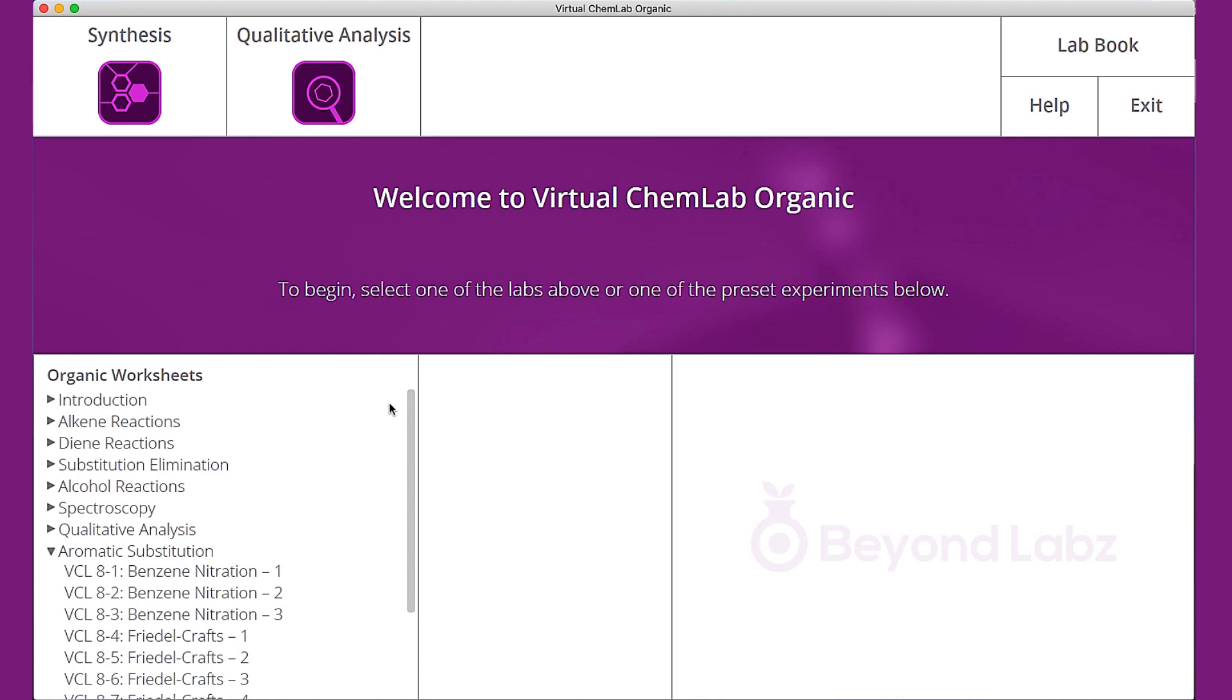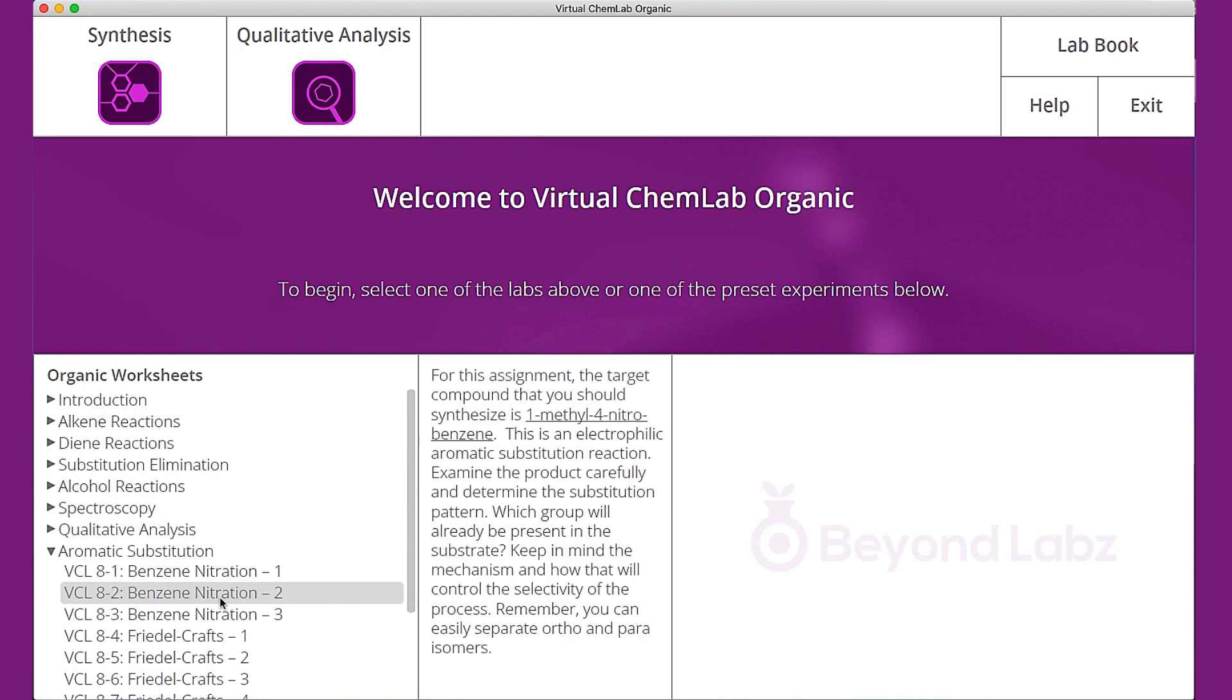The experiment preset that I'm going to use to demo this is 8-2 under the aromatic substitution. It's the benzene nitration 2.